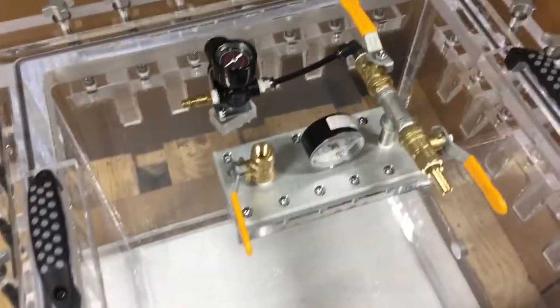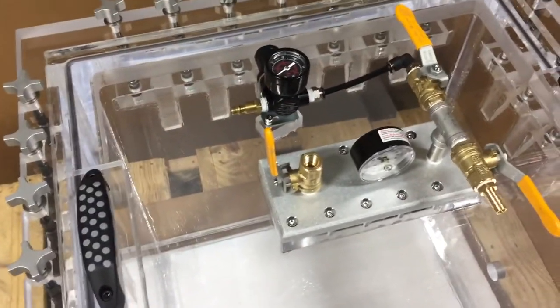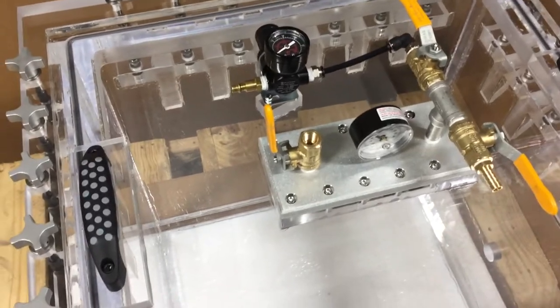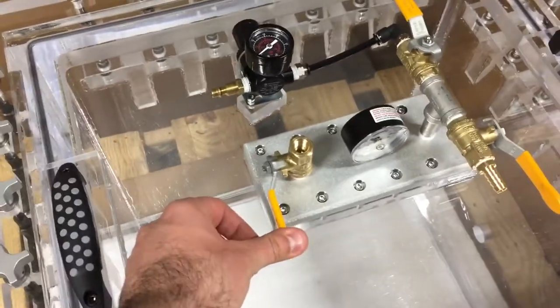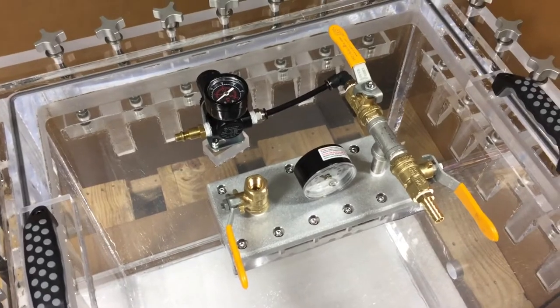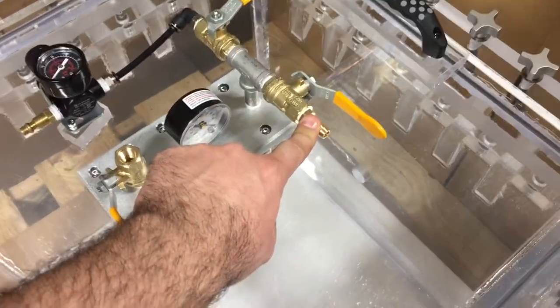The operation is really simple. What you need to do is open this valve to vent any pressure or vacuum that is already in the chamber. When you are ready to go, the first thing you want to do is close this venting valve. Then, starting with vacuum first, you need to close your pressure valve and only leave your vacuum valve open.